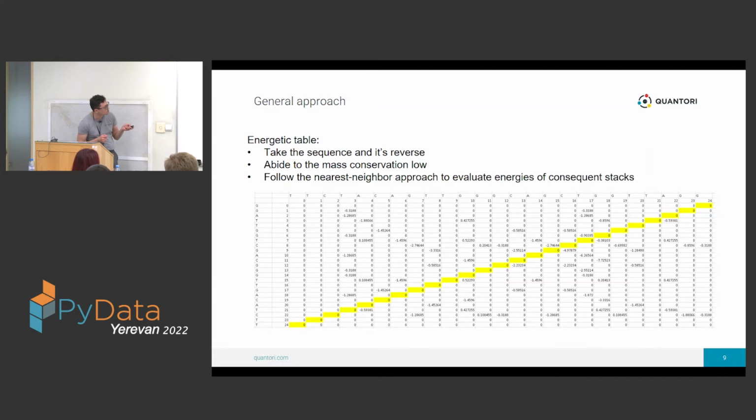So, for example, if we look at this one, it's forming a combination which is partially complementary, and the next one is completely complementary, and this produces some energy which is below zero, right?